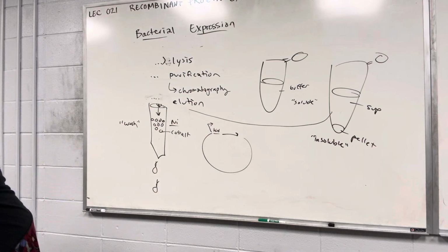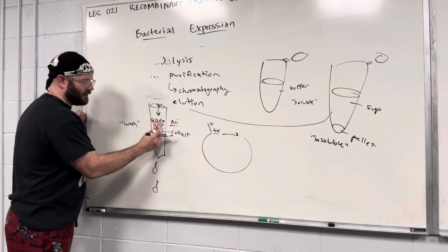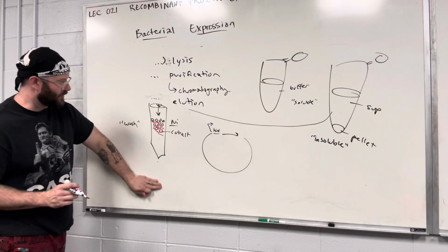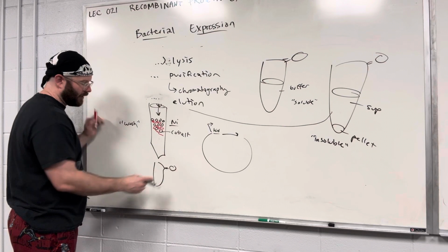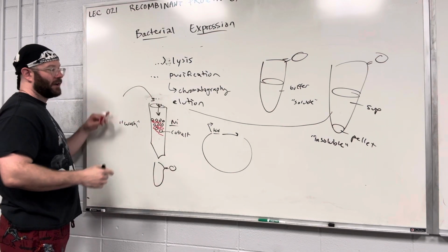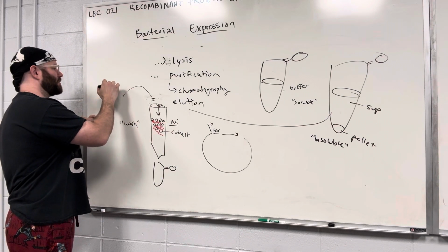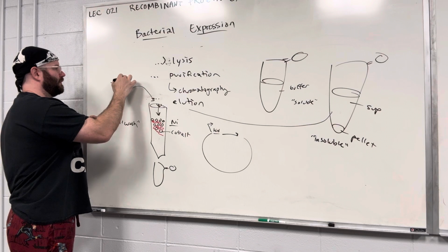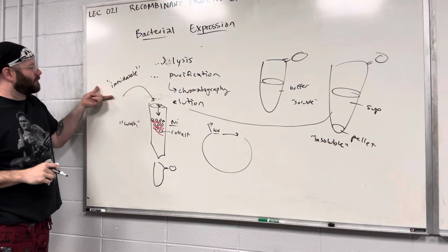So now if your protein is essentially saturated, bound to the beads, you have to get it off and recover it. So after you've done your washes, you will strategically then put a tube underneath to catch the drips, and you will add the elution buffer. If it's a cobalt His6, the elution buffer includes imidazole, which you should probably be familiar with, a very important biochemical reagent.